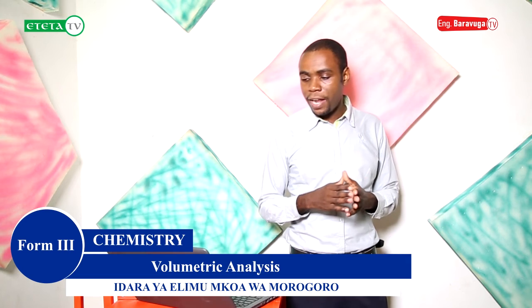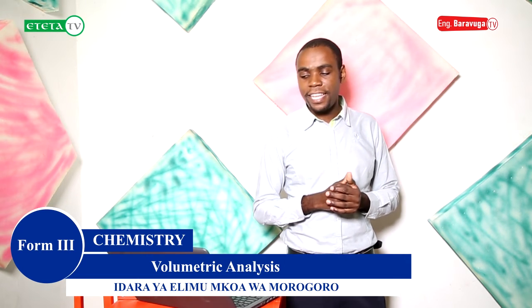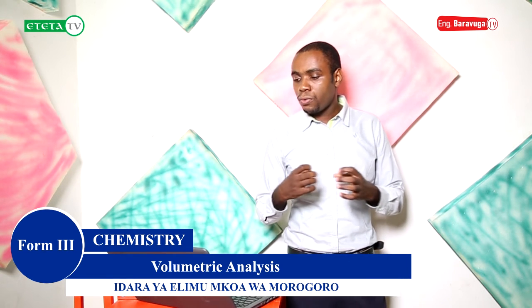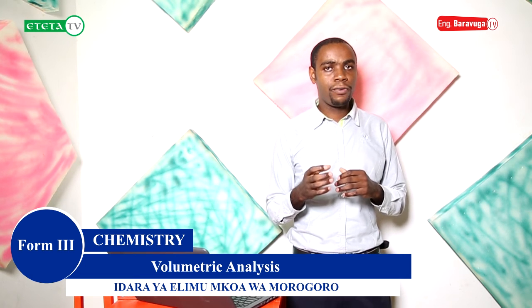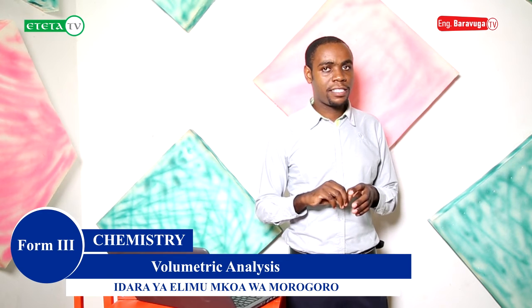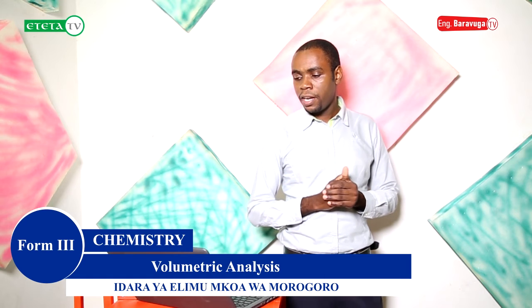Another is a conical flask, or in another name we can call it a titrating flask. The function of the conical flask or titrating flask is to mix solution during the titration process. So the acid and the base, which are going to be mixed, are mixed in the conical flask or titrating flask.